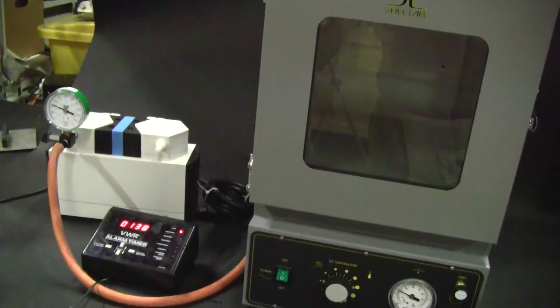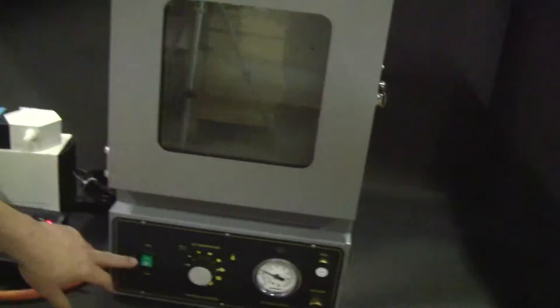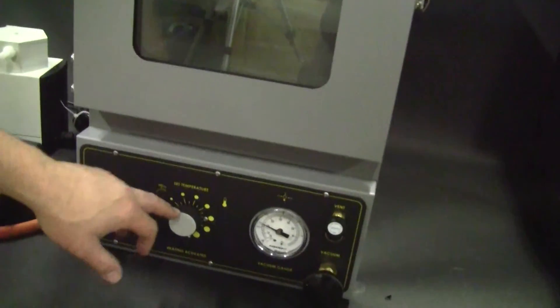Just to review this simple vacuum oven as we come down to 200 millibars: power on-off, set temperature, gauge, vent, vacuum inlet.